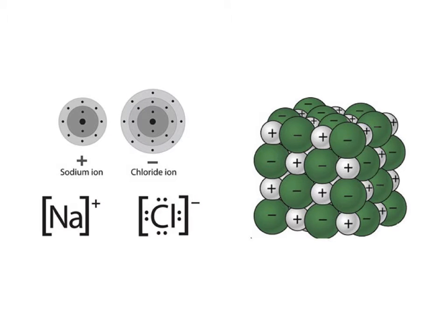As we've begun our new unit on solutions and IMAs, intermolecular attractions, one of the labs that you performed was the paper chromatography lab involving food colorings. And in this lab, we used three different solvents and you were examining the impact of those solvents on the ability to separate out the mixtures of dyes that were potentially in each of the food colorings.